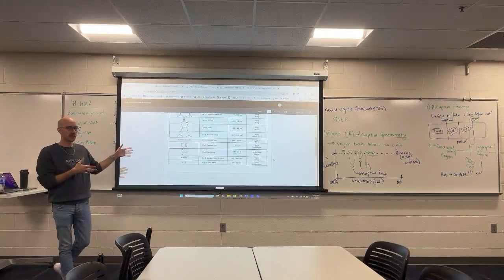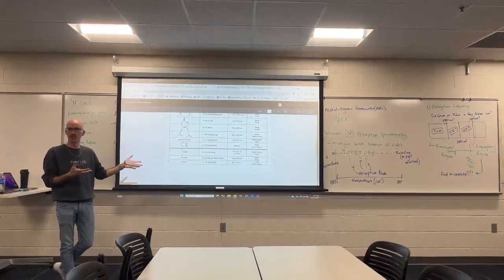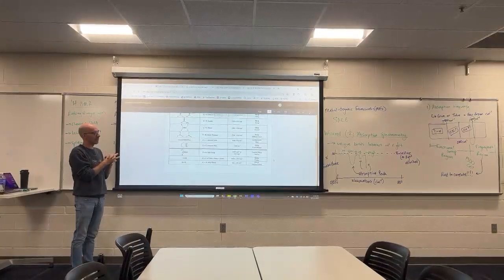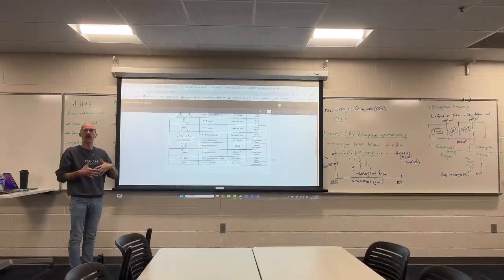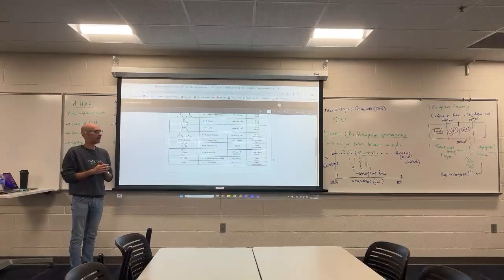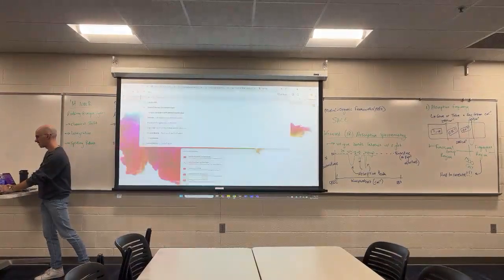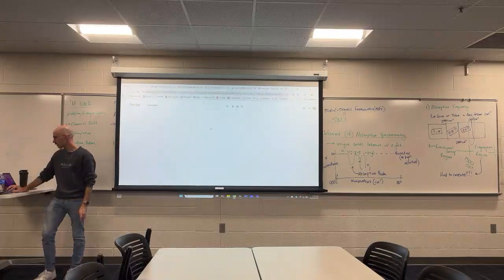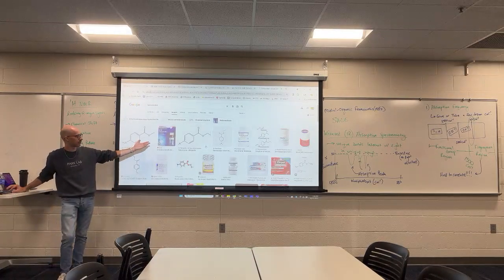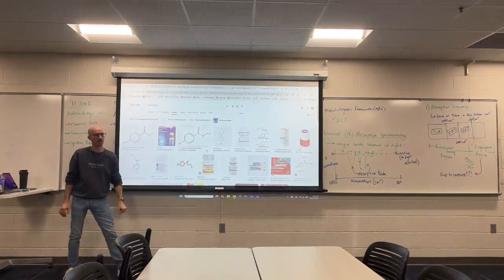I don't think they took OChem 1 here, and some schools don't really do a good job of teaching spectroscopy at all. Each week, they took an IR of their product, and they submitted it in their report. They analyzed the IR. One week in OChem 2, they synthesize benzocaine. Here's benzocaine's structure. You can see there's an amine, an aromatic ring, and an ester.